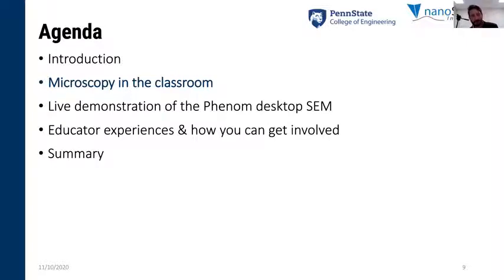The first thing we're going to talk about today is microscopy in the classroom, kind of as we know it. And then I'm going to show you a scanning electron microscope live. And not only am I going to show it to you live, I'm going to remotely control it from my laptop, just to show you how easy it is to remotely control this instrumentation. Following the live demo, I believe we're going to have a brief Q&A break. If you have any questions, Bob and Ozgur will address them during that break. And then we're going to segue over to our panelists who can talk about their firsthand experience with remote access, and then we'll wrap it all up.